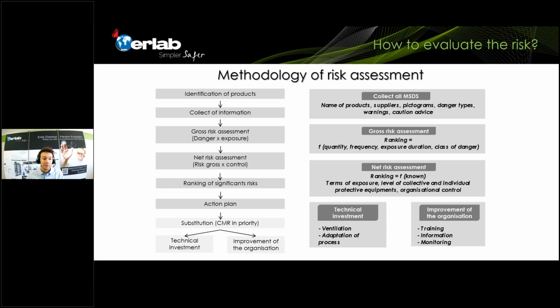When you make an action plan, one of the things that could be in there, and is really recommended by us as a supplier of safety equipment, is to use substitutes instead of the CMR products. CMR products, for the people who don't know, are very hazardous products that are dangerous for people in the lab, and that can cause cancer, for example. So if you can use other products that are less harmful, please do so.